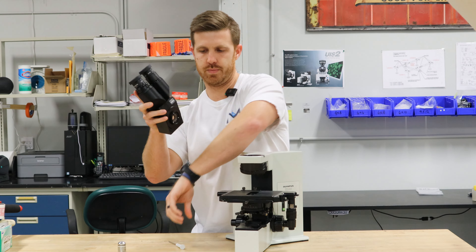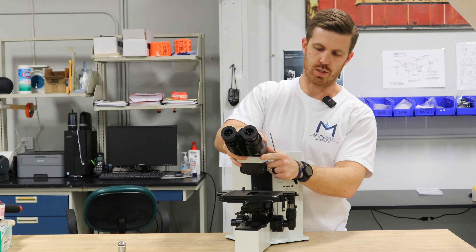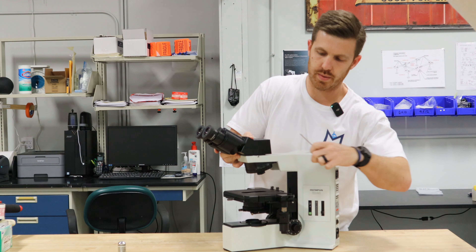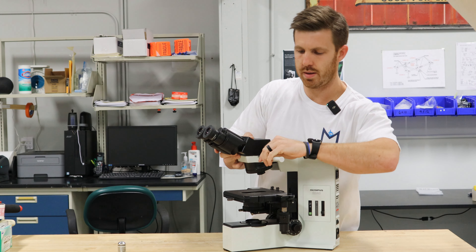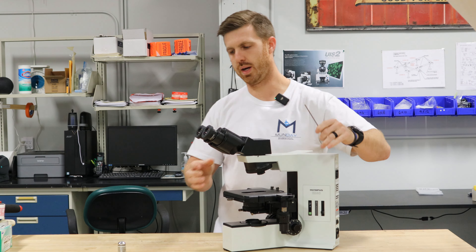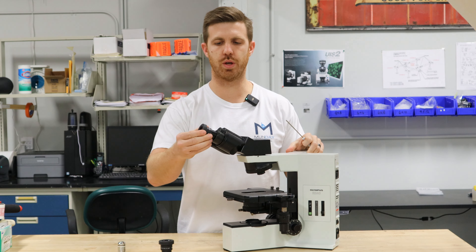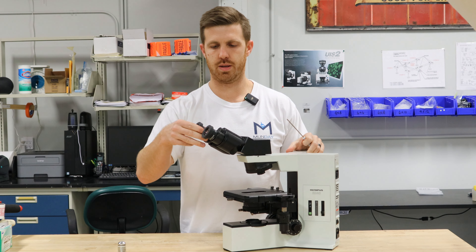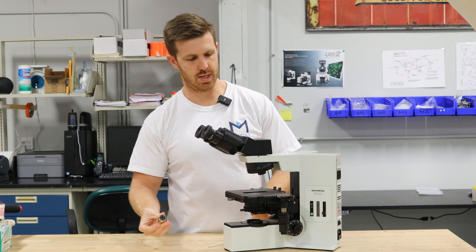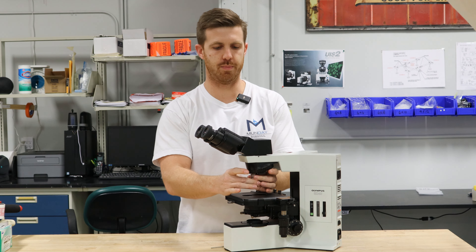Then you take the head — the head's going to go on this flange here — make sure it's nice and flush, and tighten that last screw. If your eyepieces were out, you would want to put those in there. And then the last thing is lower your stage and screw your objectives on one at a time.